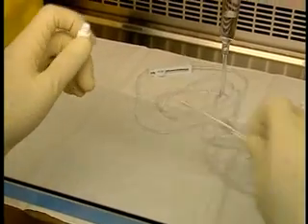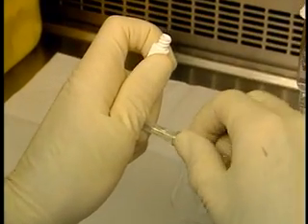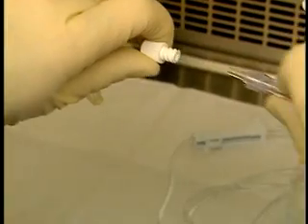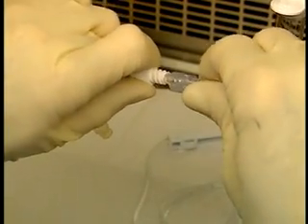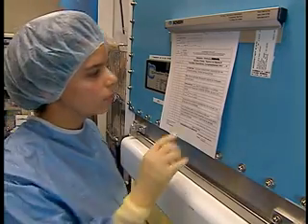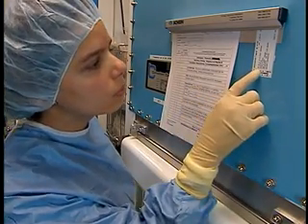Withdraw and cap the needle. Replace the needle with the protective cover at the end of the tubing or a sterile cover, depending on the protocol at your hospital. Have the tubing and the product checked by the pharmacist.